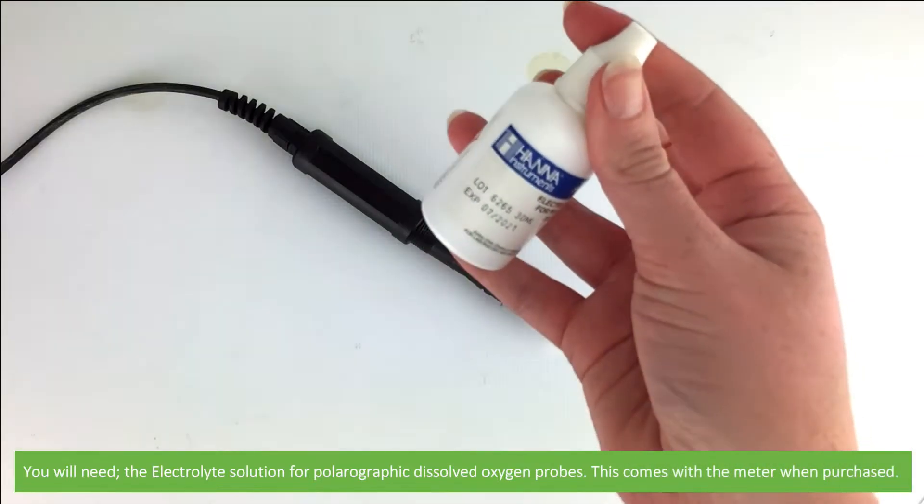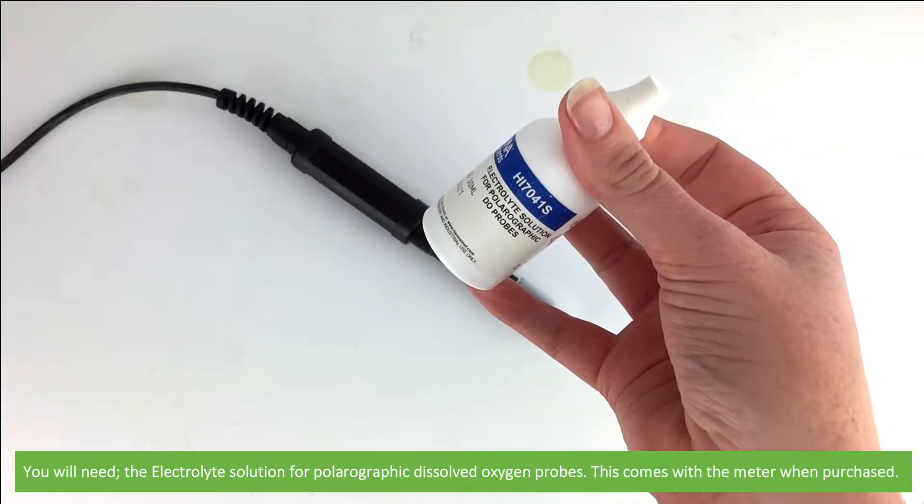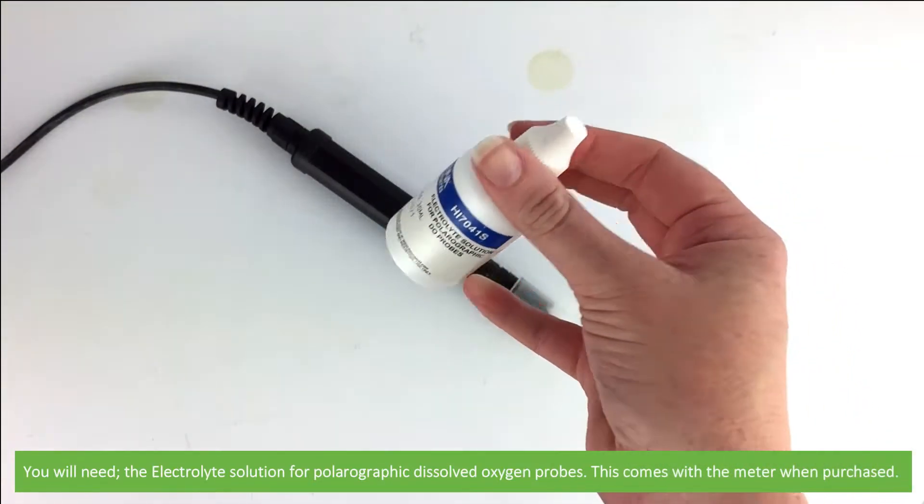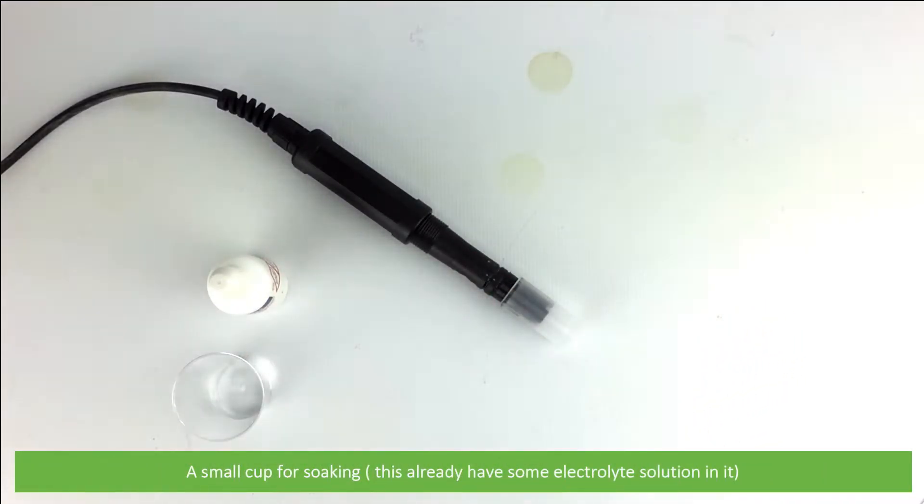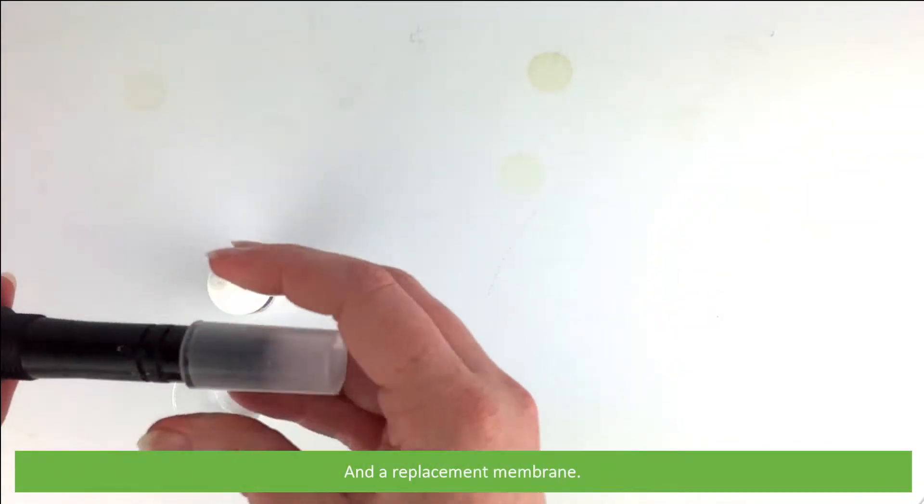You'll need the electrolyte solution for polarographic dissolved oxygen probes. This comes with the meter when purchased. A small cup for soaking, this already has some electrolyte solution in it, and a replacement membrane.